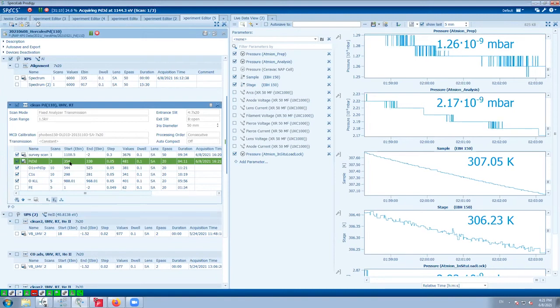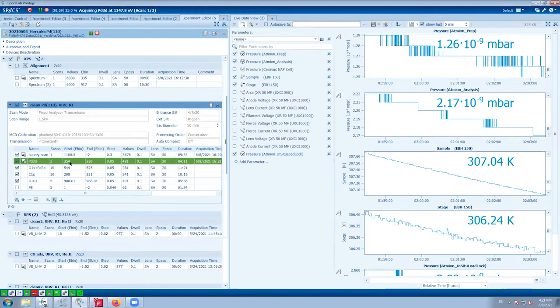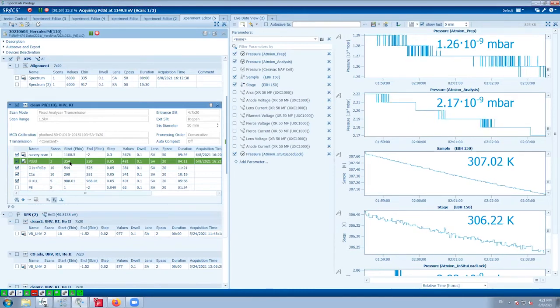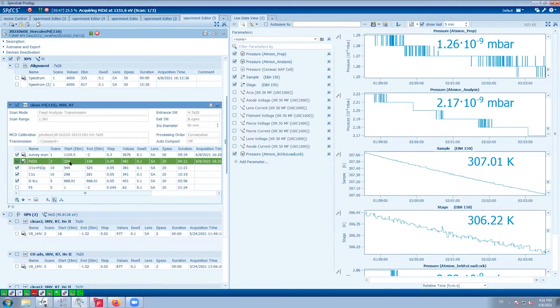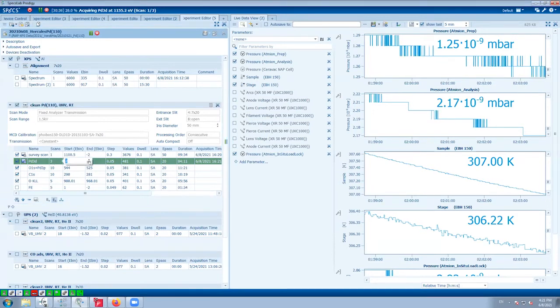It's useful if you have a catalyst that is actually changing, and you want to see the changes within time, because the changes might be within 10 minutes. You don't want to spend 10 minutes measuring one element and then miss the process, because if it's time dependent, you don't catch it if you do the first. Okay. I guess we need maybe only one scan for palladium.